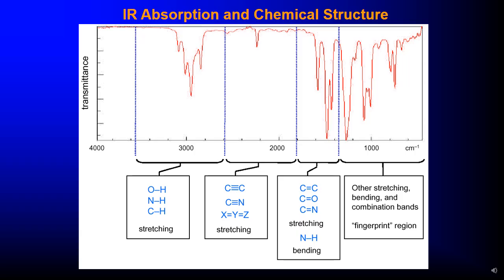So for example, we can be able to see just a summary. Around this we'll find the stretching of hydrogen attached to carbon and heteroatoms. Around this range we'll find, so generally, what we've discussed there, and it is good to note that this is the fingerprint region.